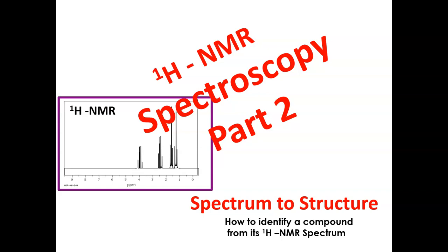So it isn't just down to this, but this has a major role to play in the elucidation of a molecular structure. So we're going to take you through how to go about doing an analysis. It's quite useful if you've got a pen and paper ready, as we will be needing to create a summary table for us to record the information from the spectrum. So this is what we're going to do.